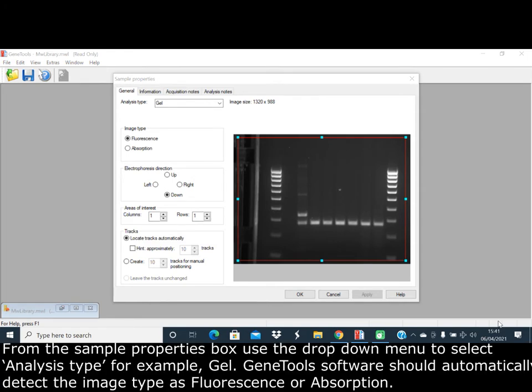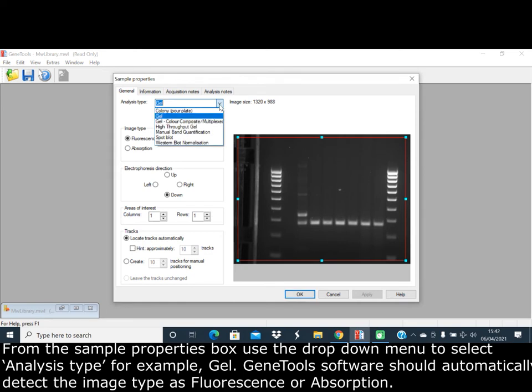In the sample properties box, use the drop-down menu to select the analysis type, for example, Gel.